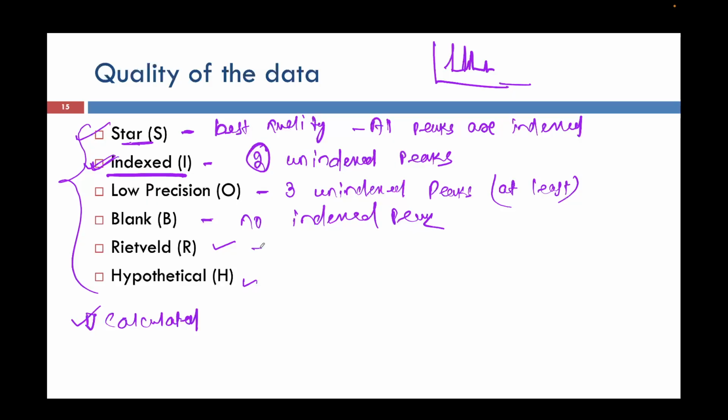So here you might have heard about the Rietveld refinement. It will give us exact data for our own sample. It will not give us exact data for the standard sample, but for our own sample, whether it has a single phase, or if it is a mixture of phases, then which phases, and what the amount of each phase present in the mixture is. All these things we will get to know from Rietveld refinement. What will be the accurate crystallite size, and what is the density of defects present in our data.